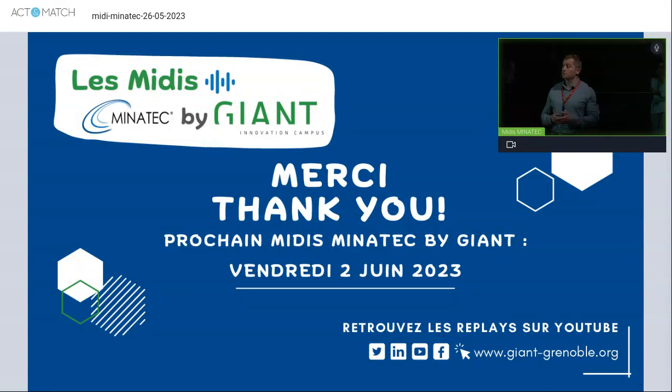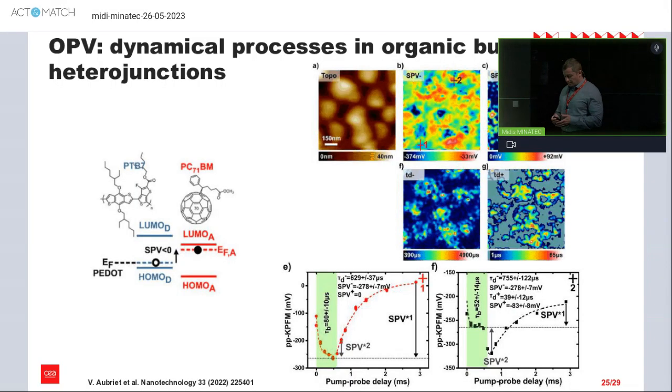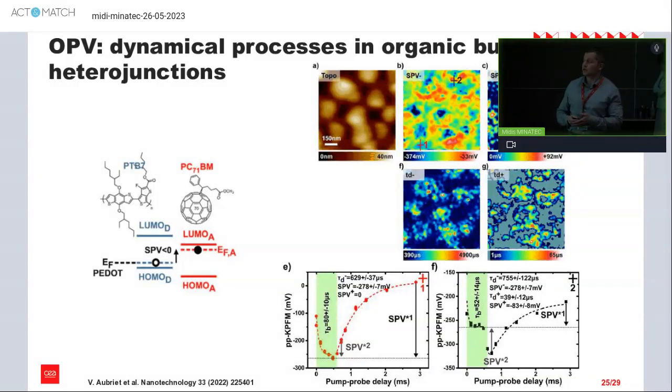I don't know if I understood your question correctly, but in this kind of measurement, I presented dynamical processes or work function linked to surface potential, which can be linked to device operation. So for example, we can see if this device is working correctly or not, or some parameters which we are supposed to have, but finally we measure locally different values.